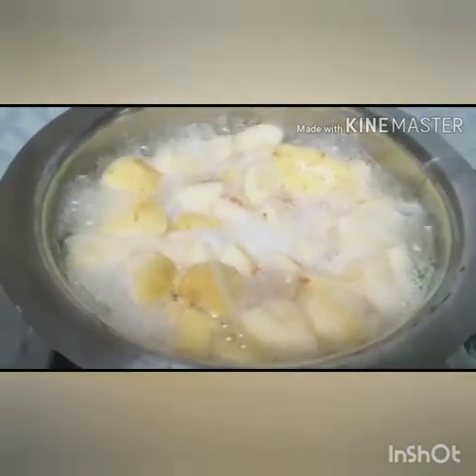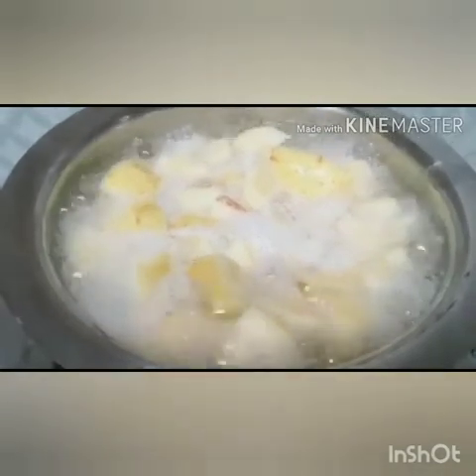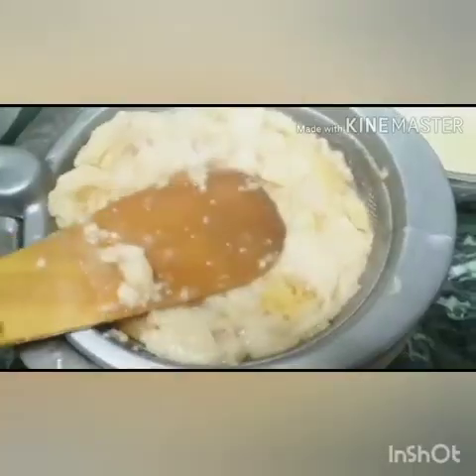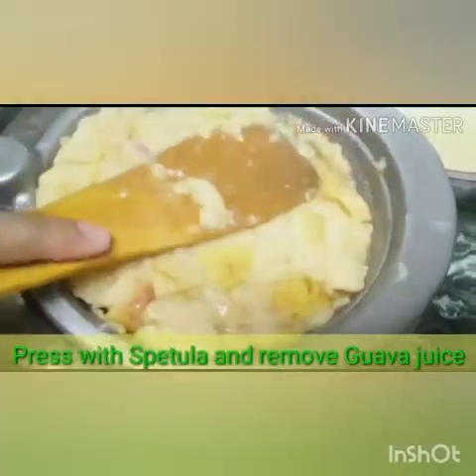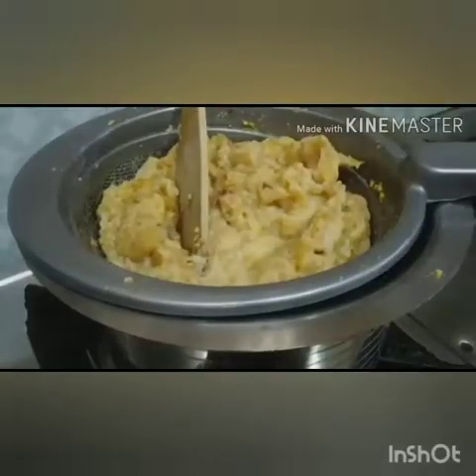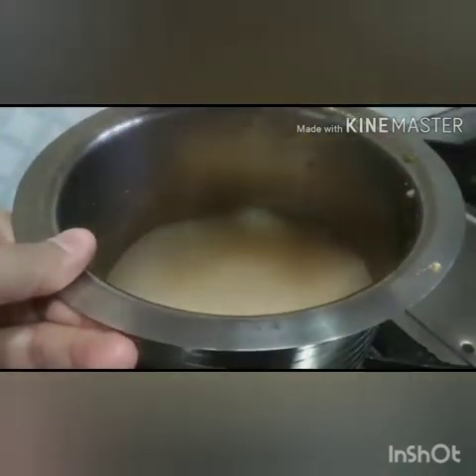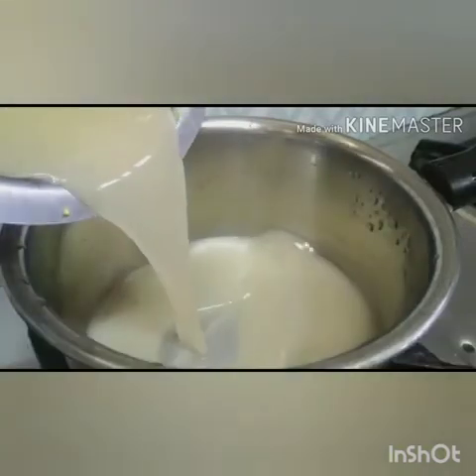After boiling, we will strain it to filter out the guava juice and collect the supernatant. Since we don't want pulp in jelly making — we just want the fruit flavor and the pectin content — we will collect the guava juice and take it into another pan for boiling.